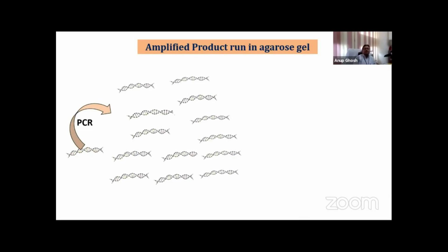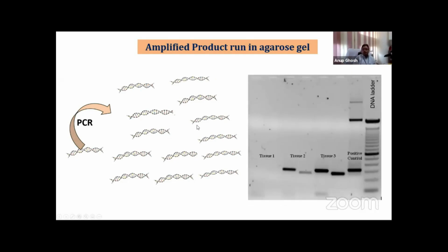And then, actually, PCR, what is it? PCR is nothing but amplifying a certain product from 1 to 1,000 or a million. So this is the way we are doing the PCR, and how will you ensure your PCR is successful or not? Finally, you run the product in a gel, the agarose gel. In the gel, you have to run one ladder or molecular marker, through which you will come to know the band size and you can match your product size. So there should be one positive control, one negative control, and your sample. So this is the way we are doing the PCR. There are certain other variations of PCR which I am not talking about, but you will come to know different kinds of PCR.